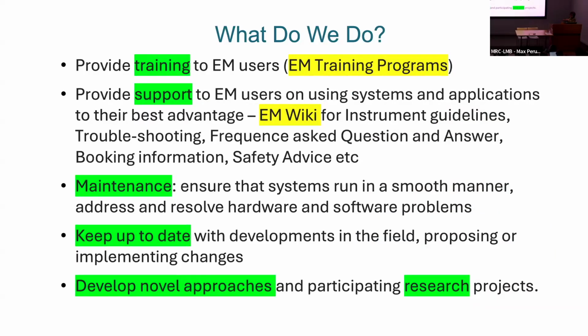Second is support. Of course, from the design of your experiment to how to set up the microscope, troubleshooting during data collection, and later, when you have a problem, what goes next. We can all provide that. We have a very wonderful EM wiki with all the information, even on how to operate the microscope.